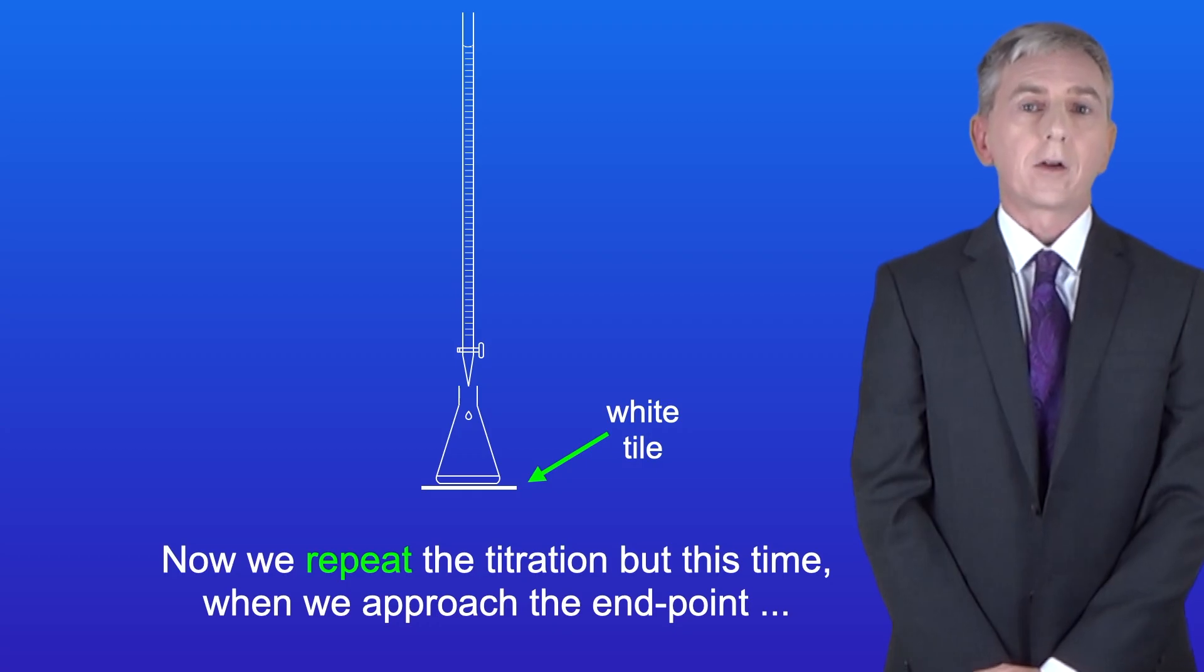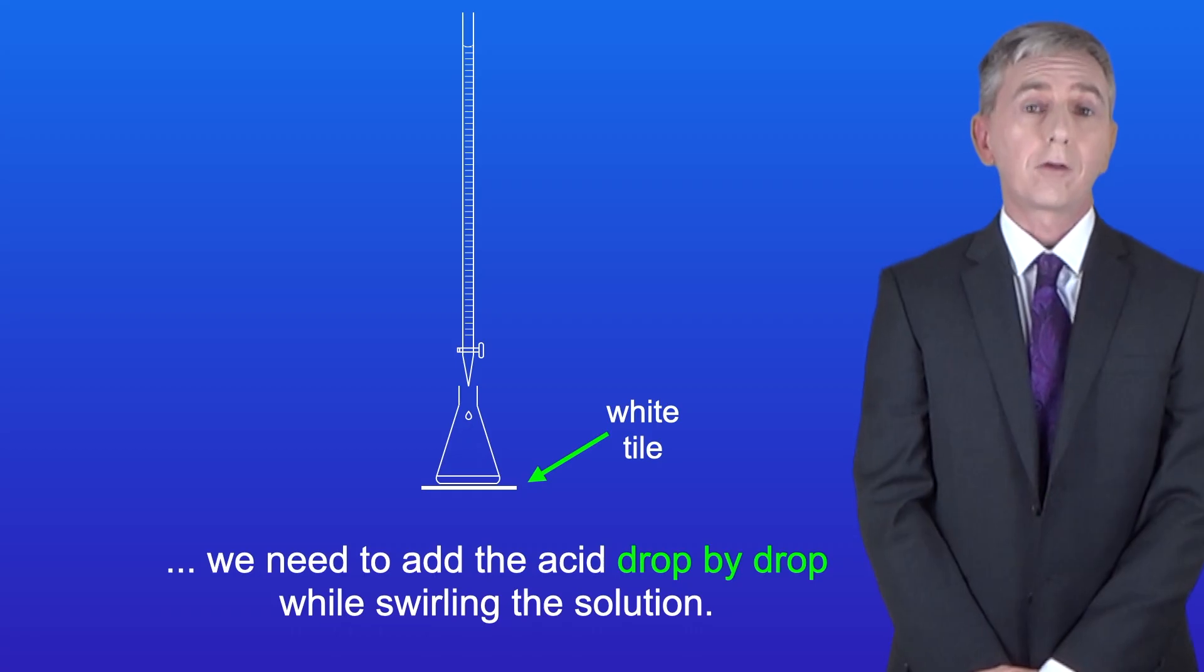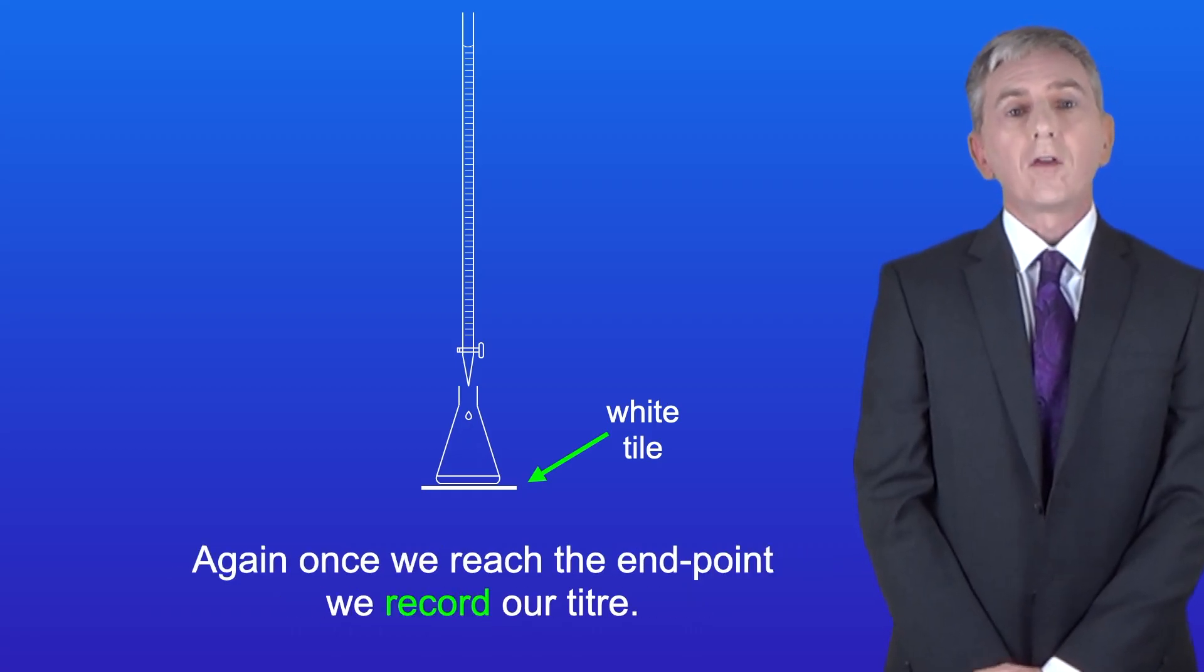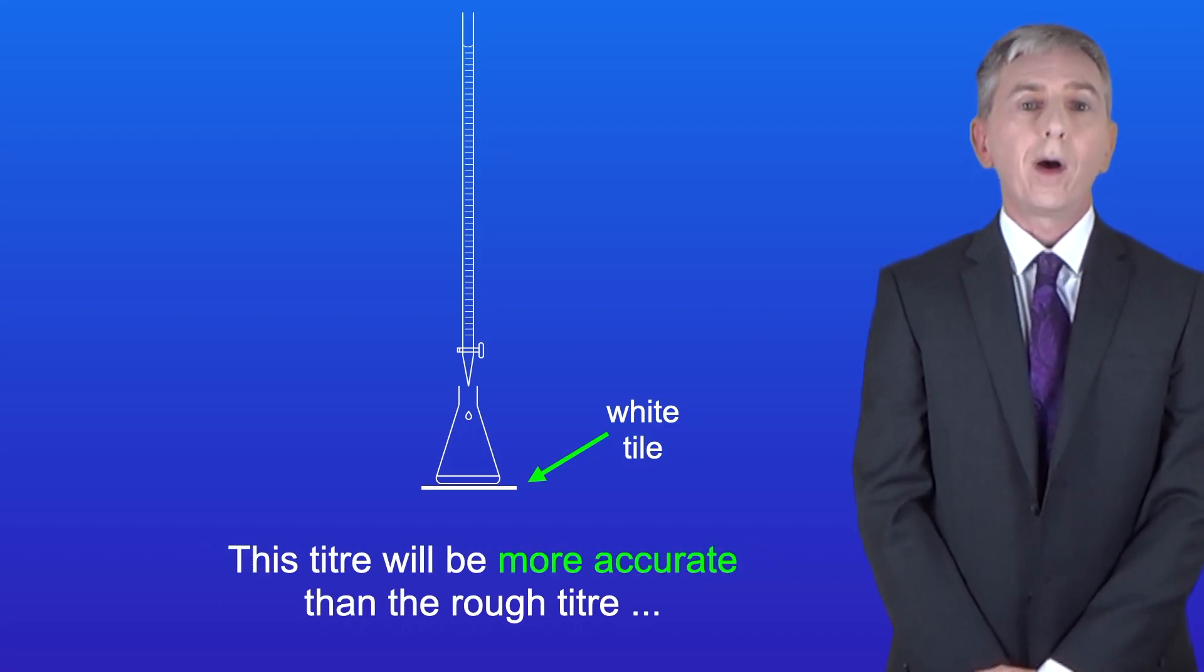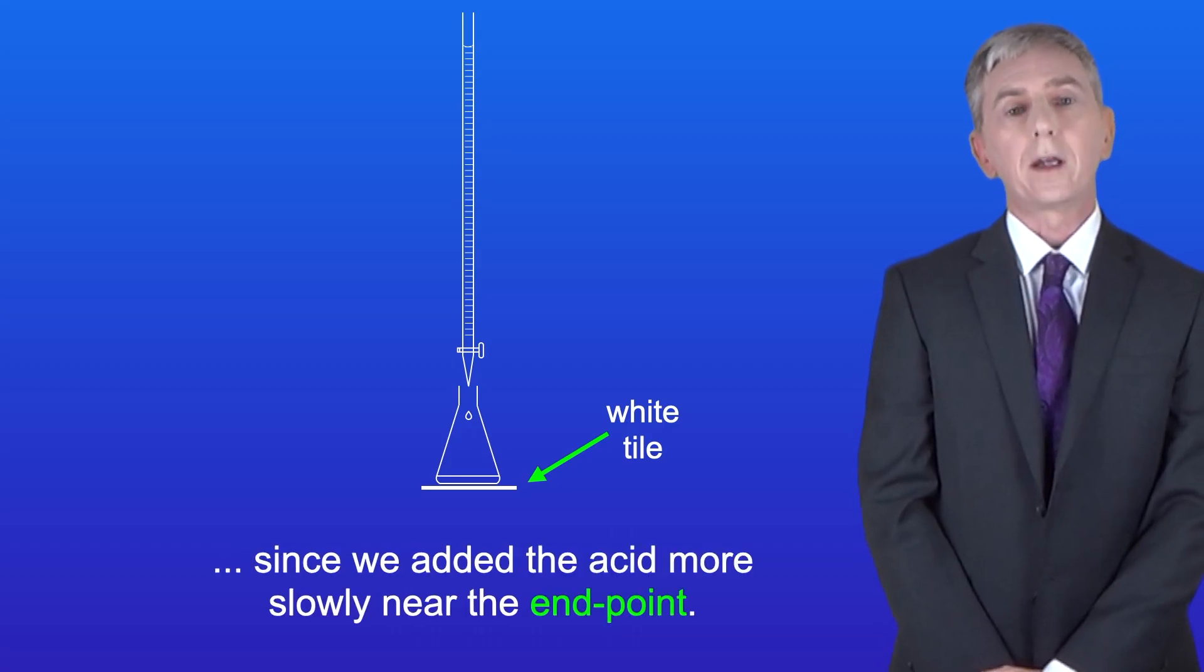Now we repeat the titration, but this time when we approach the end point, we need to add the acid drop by drop while swirling the solution. Again, once we reach the end point, we record our titer. This titer will be more accurate than the rough titer, since we added the acid more slowly near the end point.